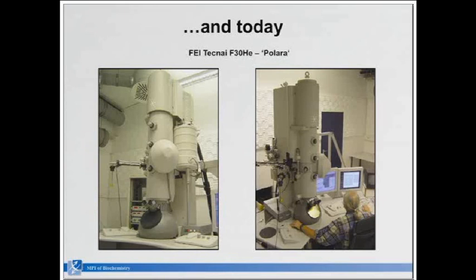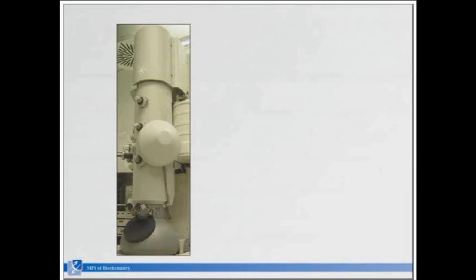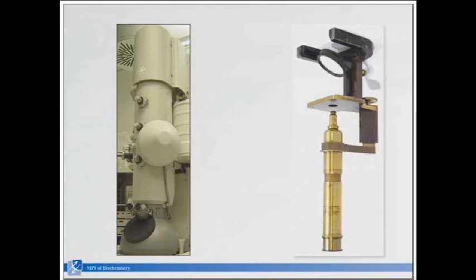With a side entry, you had to do it manually, and it takes a lot of training to get people adapted to doing the insertion of the side entry with the microscope. And it was completely computer controlled at that time as well. So in principle, when you look at the Titan Krios, it's not that different from this microscope. It's just a box around it where you can't see inside, and it's very difficult to take photos of inside because it's crowded. So this is how the microscope is set up.